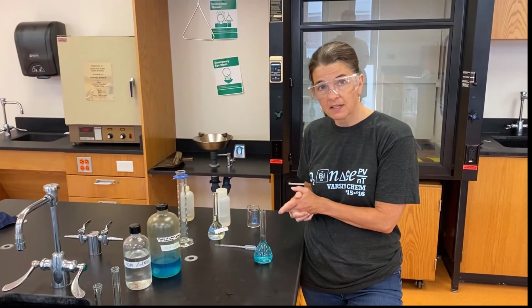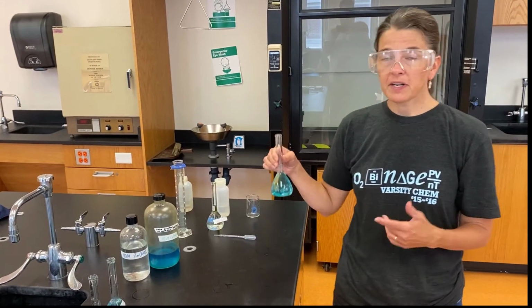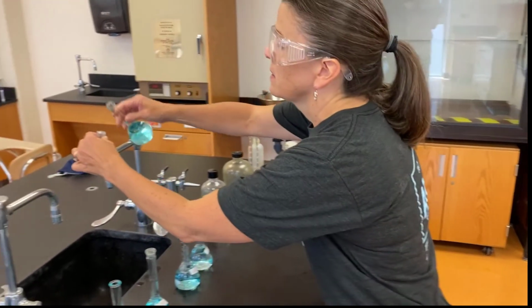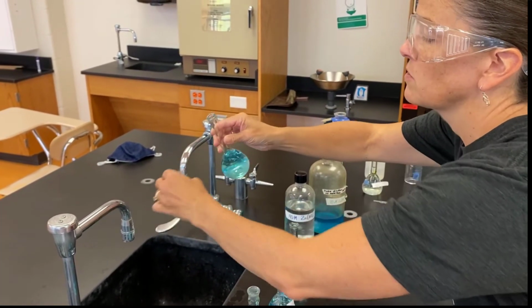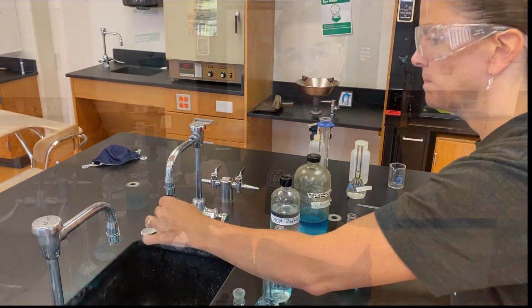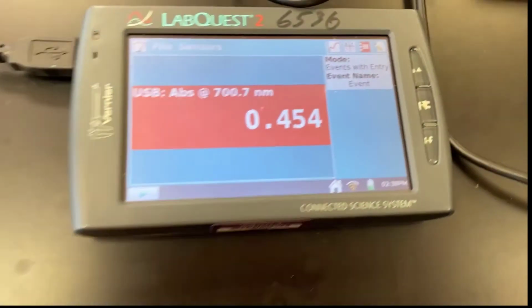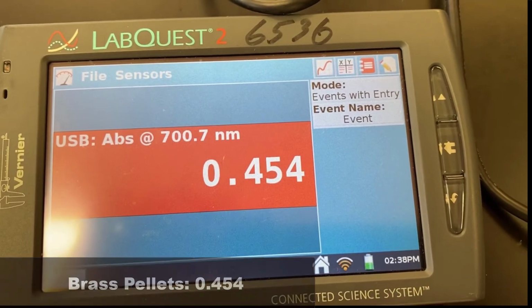So if I can determine its concentration, I will also know the moles of copper in it. So how can I find its concentration? We're going to use our SpectraViz because we already know the relationship between concentration and absorbance. I'm going to put some in a cuvette. I'm actually going to rinse my cuvette with my solution. Okay. So now I have my solution in the cuvette. I'm going to put it into my SpectraViz. And the absorbance that it's reading, 0.454 for my brass pellets.